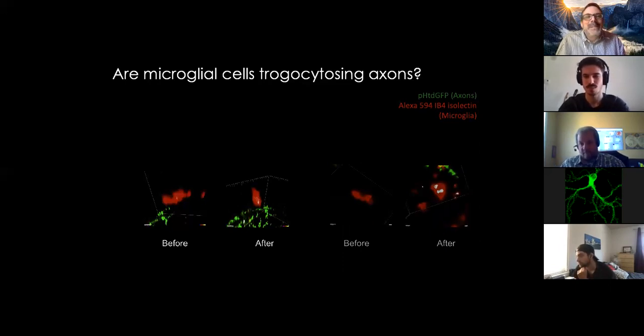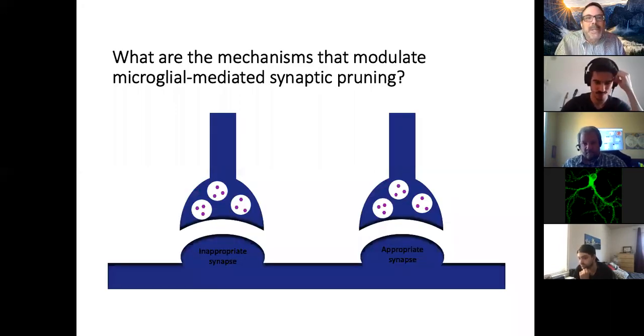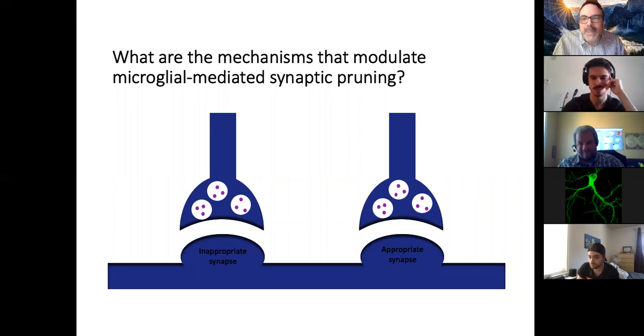How can we assess this more quantitatively? What's actually happening? So if you imagine that microglia are interacting with some kind of come hither signal, eat me signal that the axons are expressing, then we ought to be able to alter that signaling and alter then the amount of transfer of material into the microglia. And that would be a pretty strong indication then that it really is transfer.